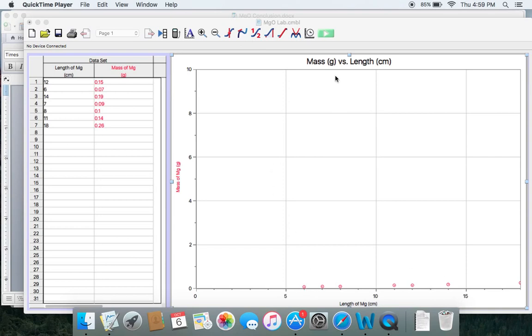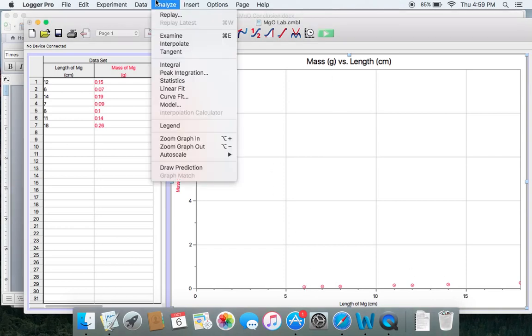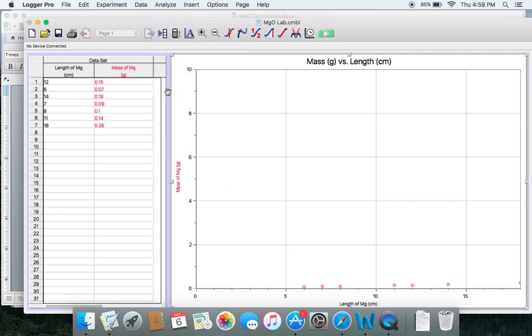Once you have your numbers put in, just go ahead and go to Analyze and Linear Fit.